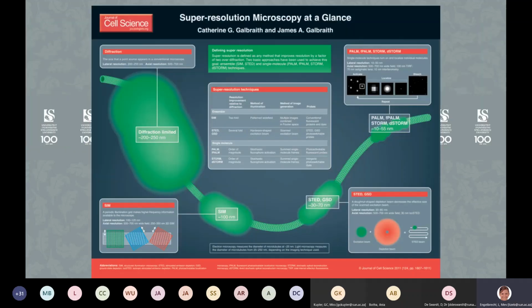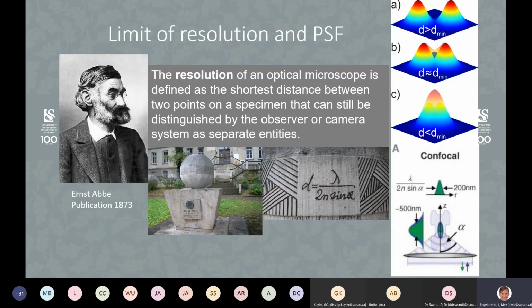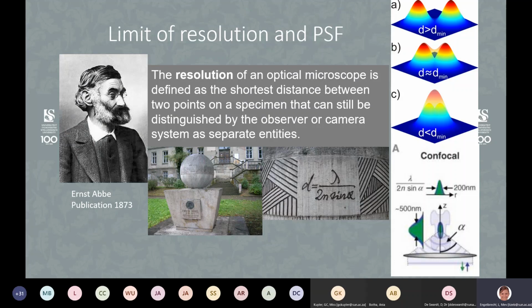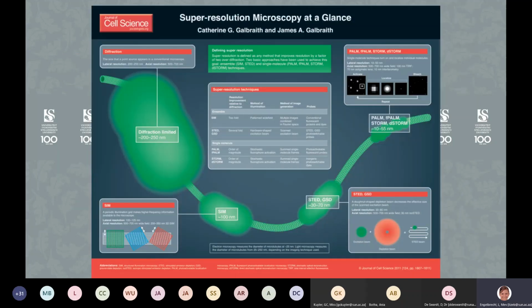if you look at a piece of, I think this is tubulin, this comes from a paper in Journal of Cell Science. If you look at tubulin under a confocal microscope, you can't see the thickness that we can see here. You would basically see this tubulin as thick as this blob here on the left-hand side. Just imagine this is the thickness of the tubulin. Obviously, we are not very happy with that. We would like to see tubulin much finer, especially because it comes in networks. We don't see it only in its single form.